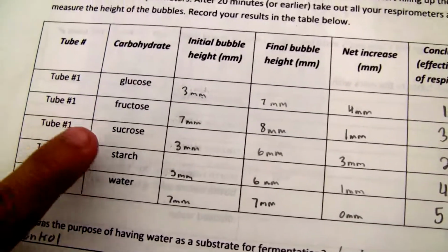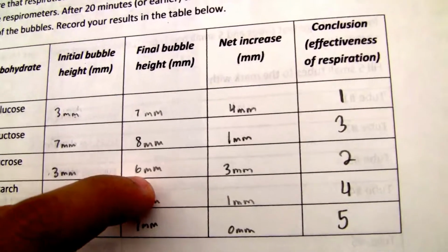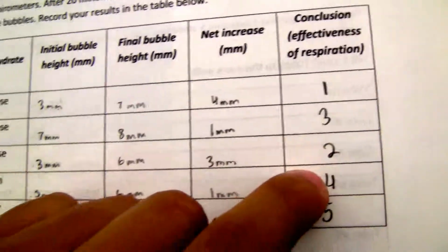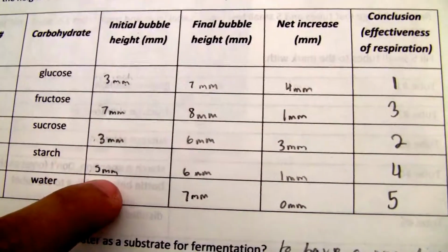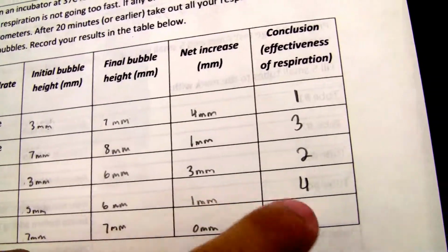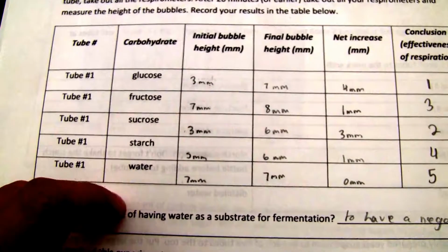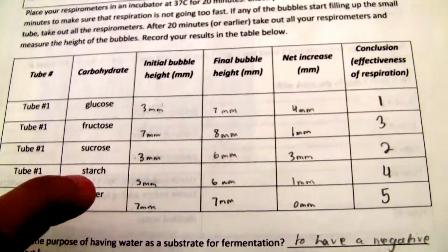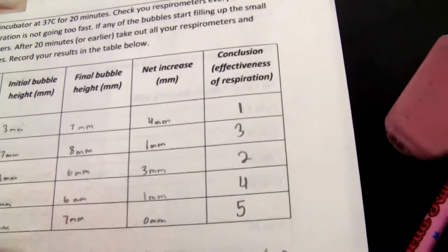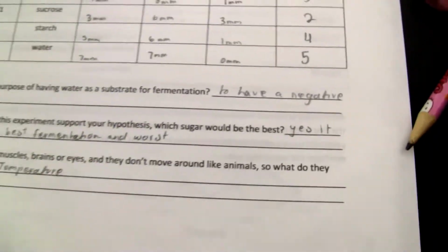Sucrose, our initial was 3 millimeters. Our final was 6 millimeters. Our net increase was 3 millimeters and came out in second place. Starch, we started off with 5. We ended with 6. Our net increase was 1, and we got it fourth place. We didn't get that one either. And our test tube 5, we had water. Our initial was 7 millimeters. Our final was 7, so there was no change, and that was the one that had the worst fermentation. So we got that one right.